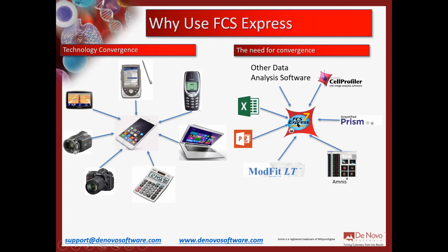So we have spreadsheets in the software. We have the ability to create PowerPoint-ready presentations in the software. We can do t-tests, ANOVA tests, really a lot of the stuff that you can do with Prism, including graphing. And the really cool thing is, when we load new data, when we move gates, when we change things around in our analysis, we don't have to copy and paste and go out and recreate all those graphs. Our Excel spreadsheets in the software update in real time.